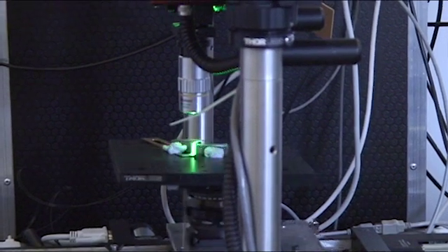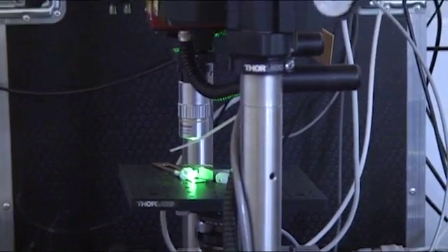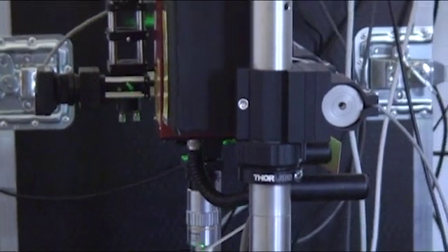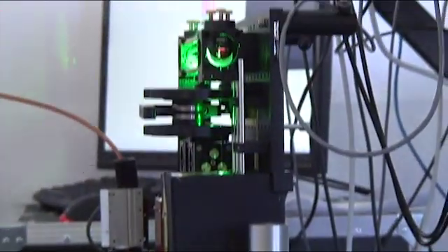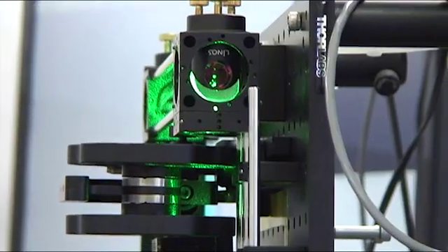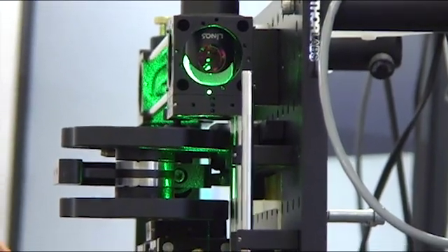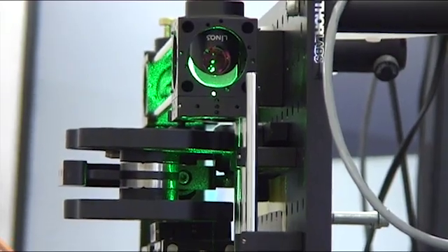From this technique point of view, we're the only ones working in this area. There are other techniques that people are trying to do these sort of measurements with optical, but they have their fundamental limitations. And the competing technology of EBSD is always going to be limited by size because you've got to fit it in an electron microscope. So although they're getting faster and very clever with the information they provide, it's never going to be in an industrial setting, whereas SRAS has the potential to do that.